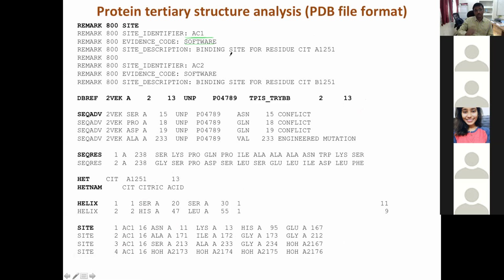Now here I'd like to remark two things. One is that when solving a structure, many times, when you crystallize a protein, you need a very high concentration, and you need a certain chemical compound in order to concentrate and start seeding the crystallization itself. For example, PEG is one such compound. You have water which is bound to your protein. You can have something else bound to your protein. So when you are solving a structure, you not only solve the structure of the protein. Apart from this, you also solve the structure of anything that is bound.